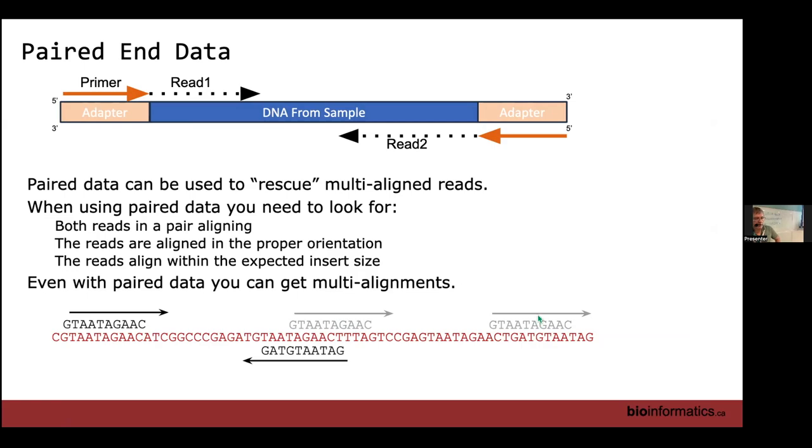The advantage of having paired reads, where we're mapping both ends of the fragment, is that we take the other end of that second read that exists. And you'll see with all the FASTQ files, they always come in a pair, read one and read two, okay? And we can map that as well. And we can see that maps in this example here to just a single location. That gives us a very clear indication because we know what the rough fragment size is. We're going from about maybe 250 to 400 base pairs, which is not represented here, but working with that pair gives us a clear indication that this read here, which maps at several locations, really is coming from this location right here. And we use the data in that way to get better mapping of reads against the reference.